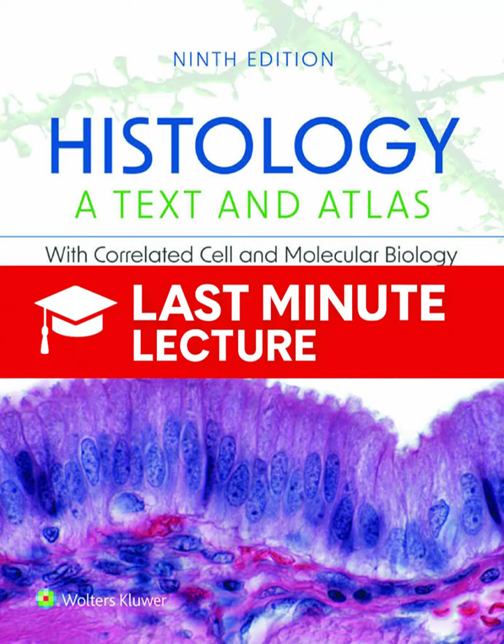The result, which you see in Figure 1.12, is a remarkable 3D reconstruction of galanin-positive cells in a rat spinal cord, all built from stacks of these clear, optically sectioned images. The other key optical sectioning tool is the confocal scanning microscope. What's the fundamental innovation that makes it confocal?